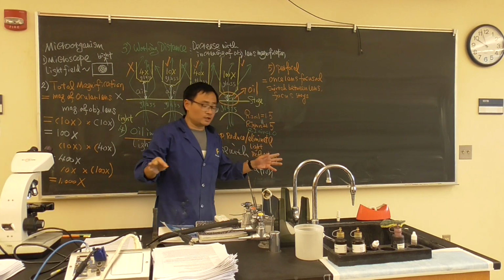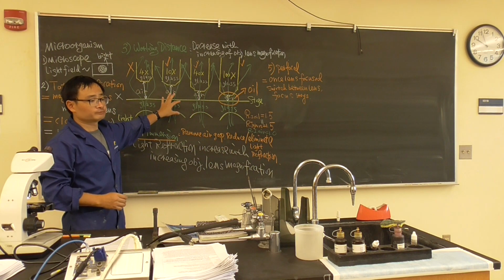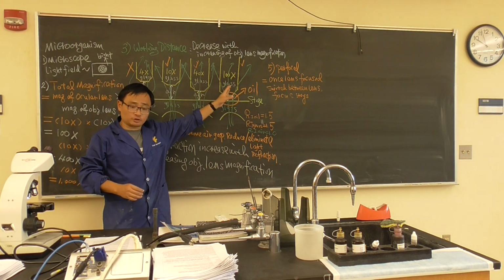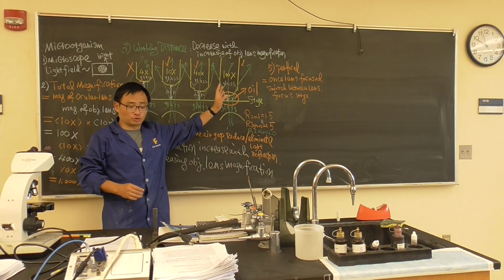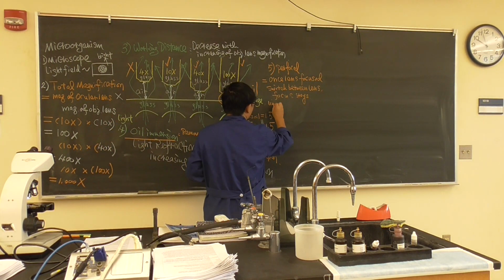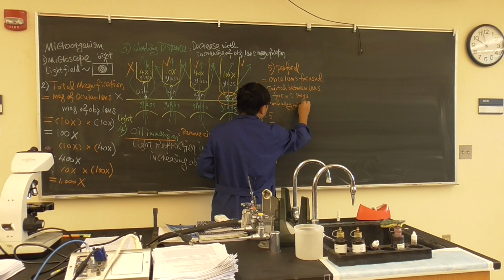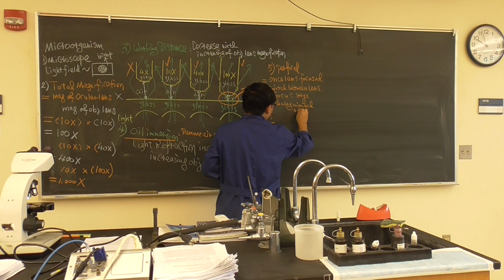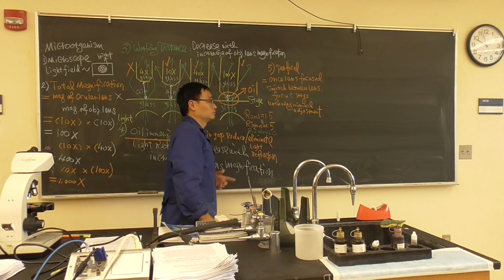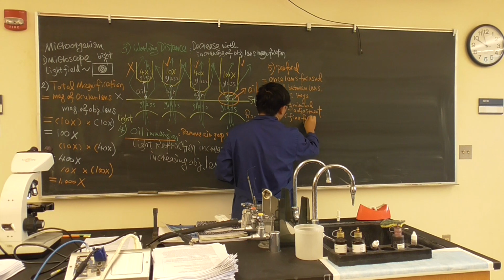So what this means is, if I use 10x to find the specimen, then I add 1 drop of the oil, and I need to switch to 100x, you only need to do very minimal adjustment. Which means, obviously, you are using fine focus.